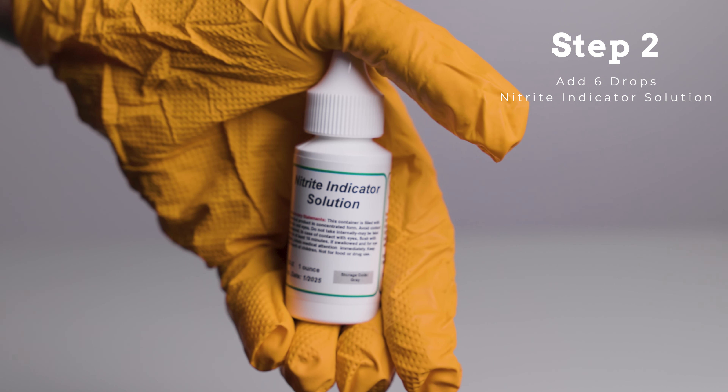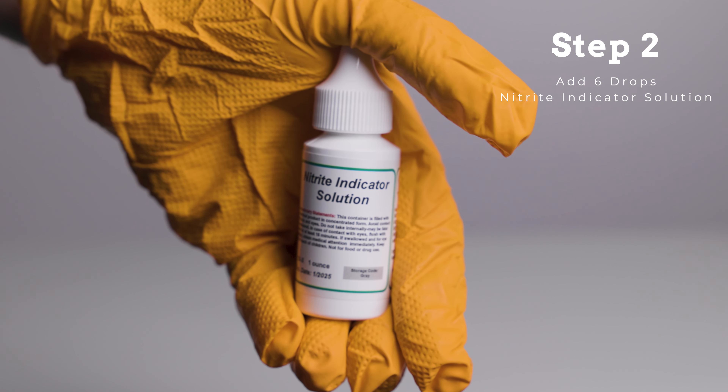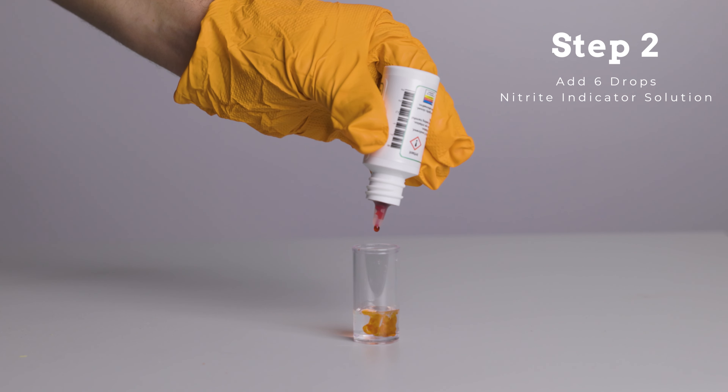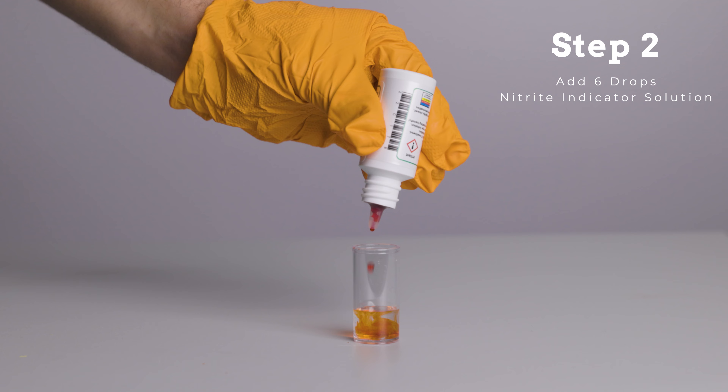Step 2. Add 6 drops of nitrite indicator solution to the test bottle and swirl the test bottle to mix. If the water turns red, nitrite is present and the test should be continued.